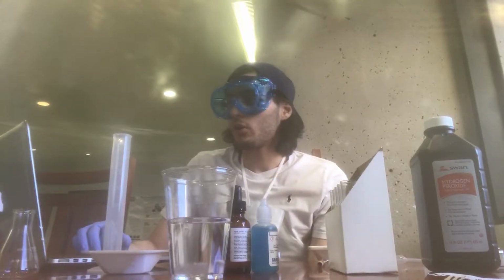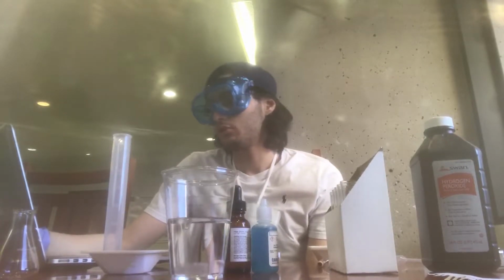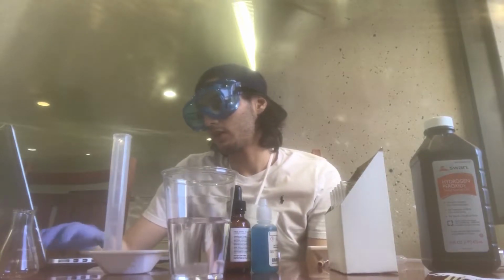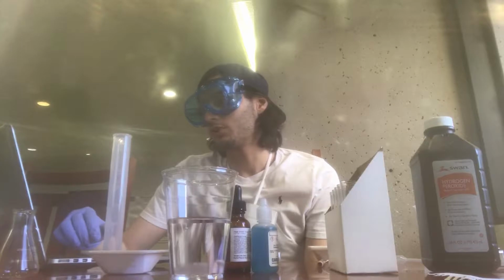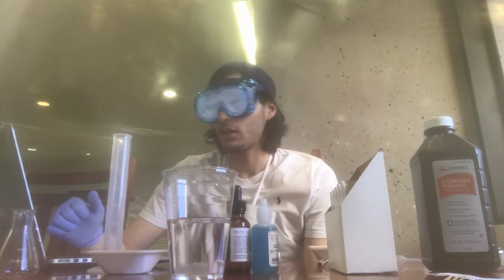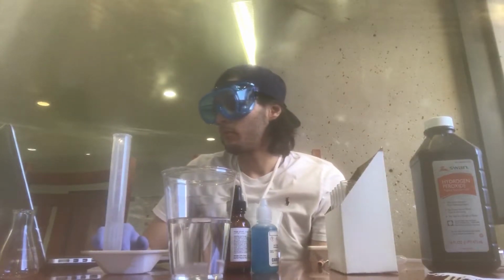Copper chloride, one of the chemicals we'll be using today, is an aqueous solution and is in equilibrium with copper hexahydrate. This whole lab investigates how this equilibrium can be shifted to the right or left by changing the temperature and concentration of the reactants or products.